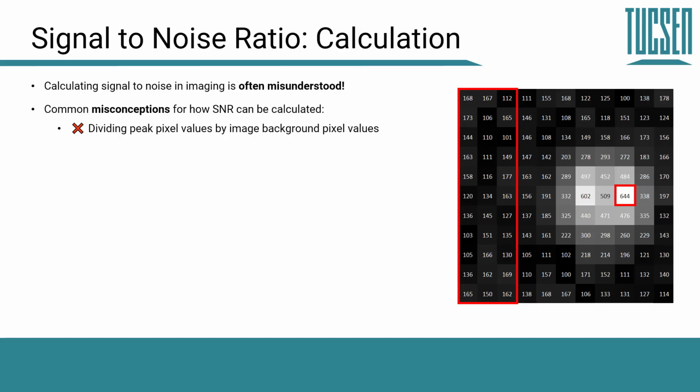It's maybe giving you some rough indication of signal to background, but even that is completely off in this particular way of doing it, because all of these pixel values in almost all scientific cameras will have some offset value, for example 100, added to them. So this straight up division is not serving any purpose at all.